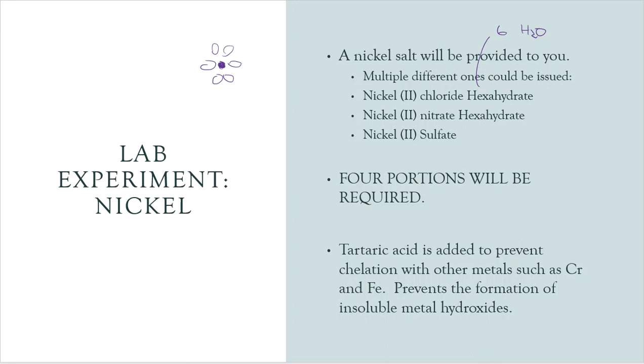Okay, so 4 portions are going to be required. Why? Because each one of these are going to be done separately, and you're going to calculate an average.